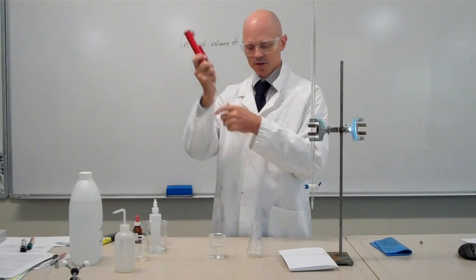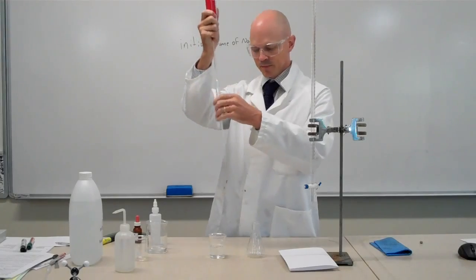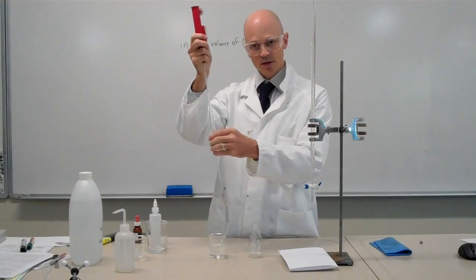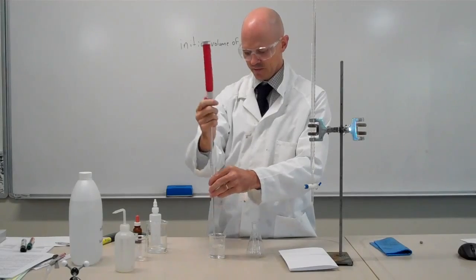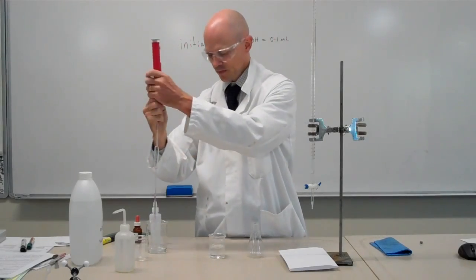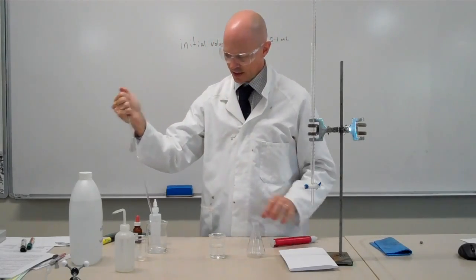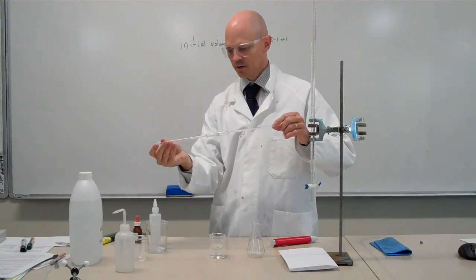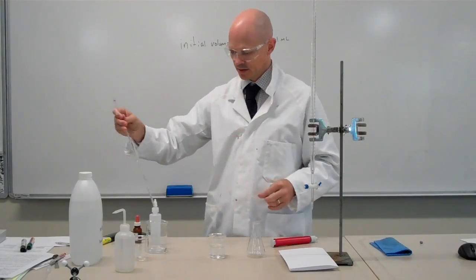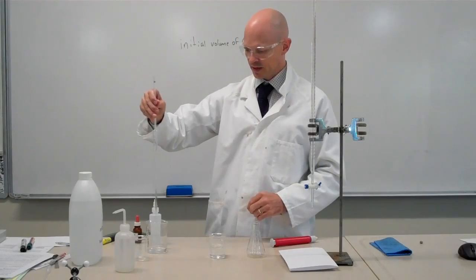The pipette needs to be washed out with the liquid that's going in it. I don't want to change its concentration either. So I'm going to draw up some of my vinegar solution into my pipette, let it drain out and also wash out my pipette with the solution that's going into it, which is in this case, my vinegar solution.